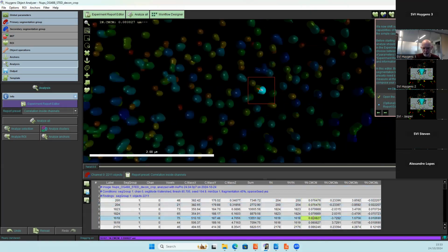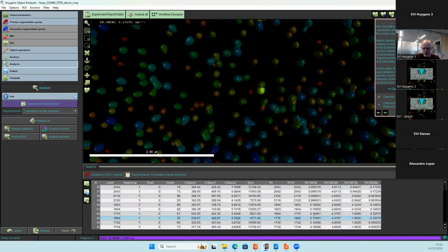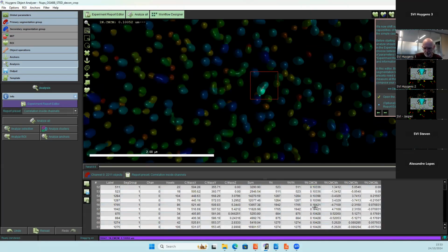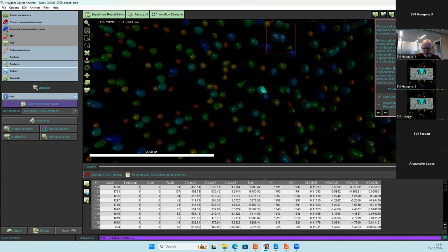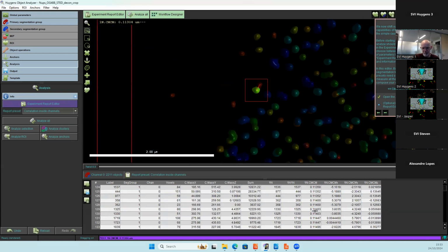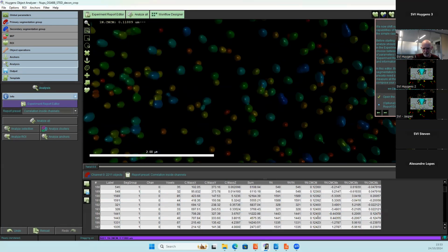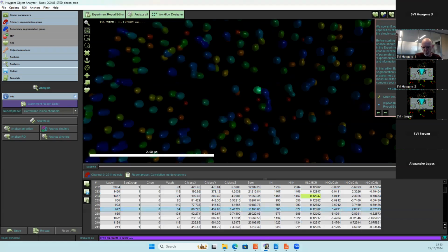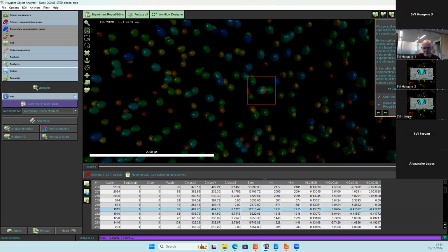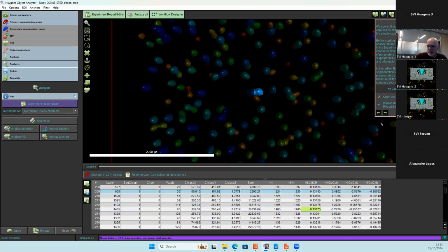This is not a fair one because this is segmented also with watershed. Here I have just two that are quite loose from one another. A bit further. Okay, close enough. Yeah, we're going to the 100, 110 range. Okay, a little bit further away. Okay. Yeah, here we're getting close. So 120, 130 nanometer. Those we can separate already. So that is with STED. That's the benefit of using STED.